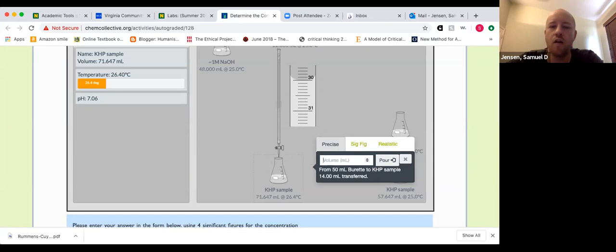Now this would usually be the time where we've added a bunch to it, and we now want to go in a more precise amount. If we were doing this in the lab, this would be the point where you would do it dropwise. You want to turn it on to where you can put a drop in, but it's slow enough that you could turn it off in between drops. So we can choose our volume here. The milliliter reads in 0.1, so 0.1. Now watch when we do this. That's a 0.1 increment.